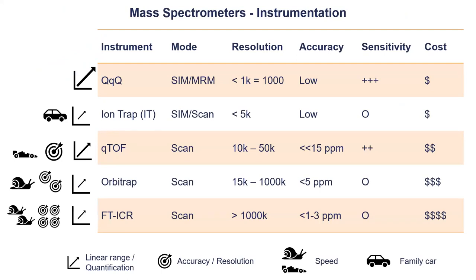And this is just a very brief overview of which different systems we have and what is actually important. Maybe some people are like, oh, we only have a triple quad or a Q-TOF, I always want an Orbitrap. I mean, every system has advantages and disadvantages. Of course, you're limited to the system that you have in your lab, and it's often good enough for your sample. You need to see what you're actually looking for. Maybe a collaboration partner has the system, which is most of the time also very nice.